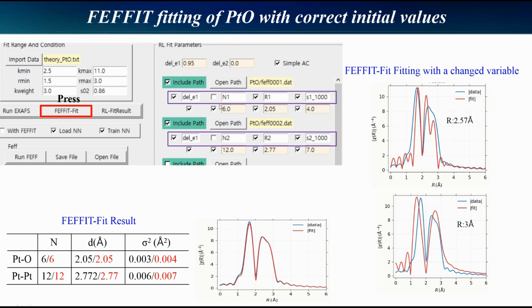The coordination numbers of platinum oxide and platinum are fixed to reduce correlation. Subsequently, clicking the fit button, the fitting runs in Larch.